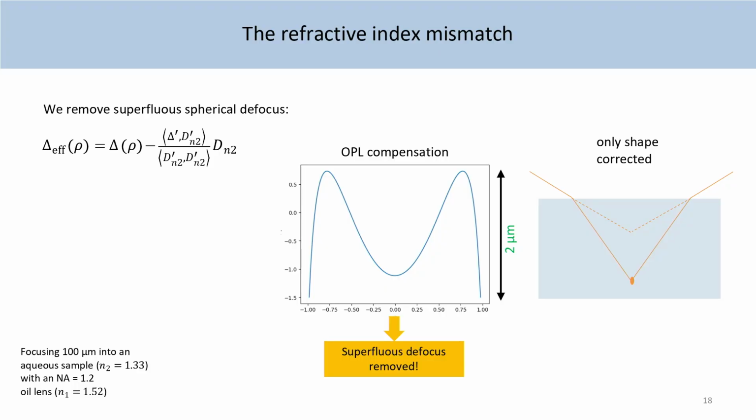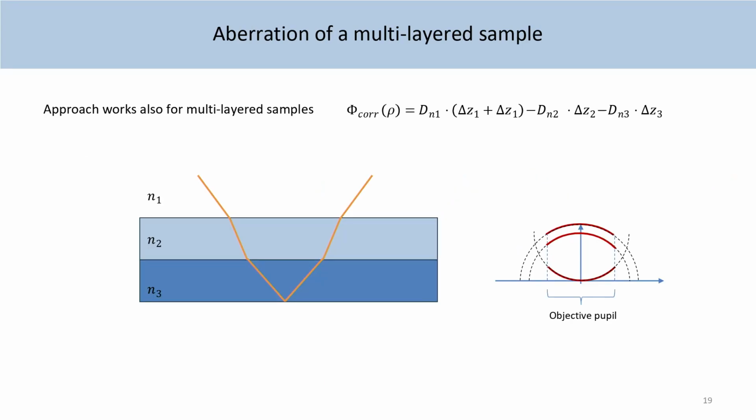So we leave the shifting effect of the refraction, but we cancel the effect of the aberration. And then you get this sombrero-like shape that you have probably seen a couple of times if you are into AO. And you see, actually, this can be generalized quite neatly.